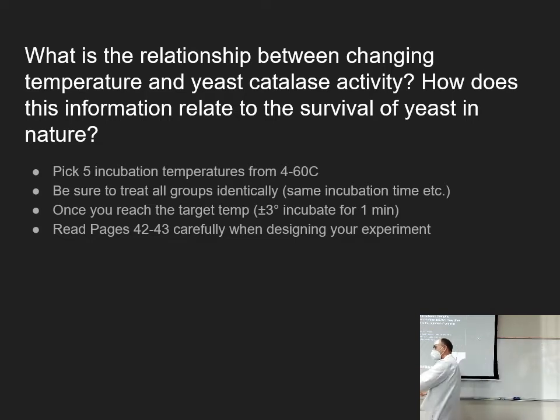Now your peroxide, I don't know if I mentioned this last time, will turn into water and oxygen all by itself if you just add activation energy to it. It's a somewhat unstable molecule. That's why it's sold in brown bottles, because sunlight is enough to get it to start changing to water. So we'll want to keep that in mind. If you're near a window, and you have peroxide poured into a clear cup, keep it on the shady side.